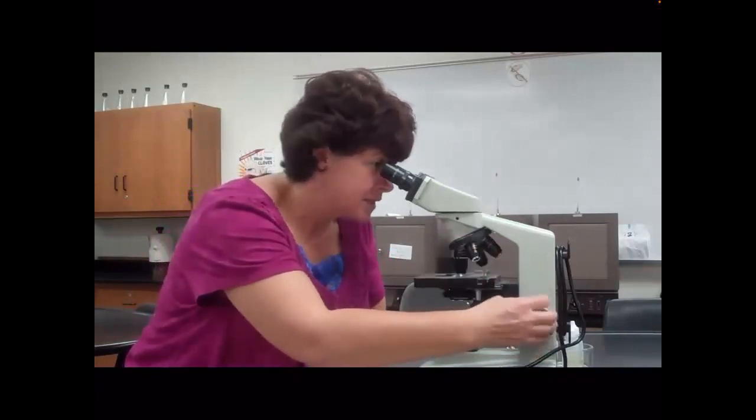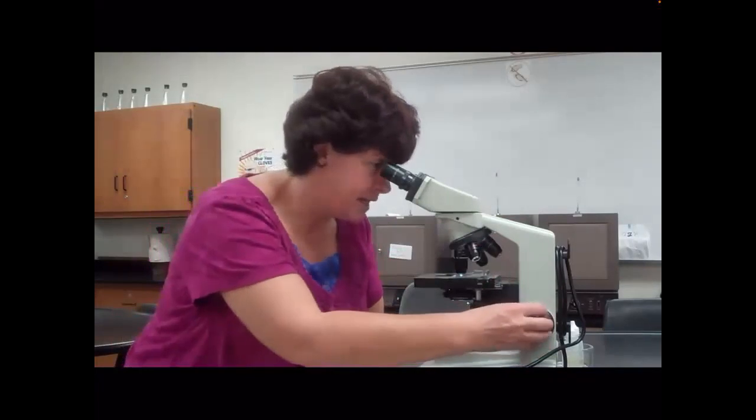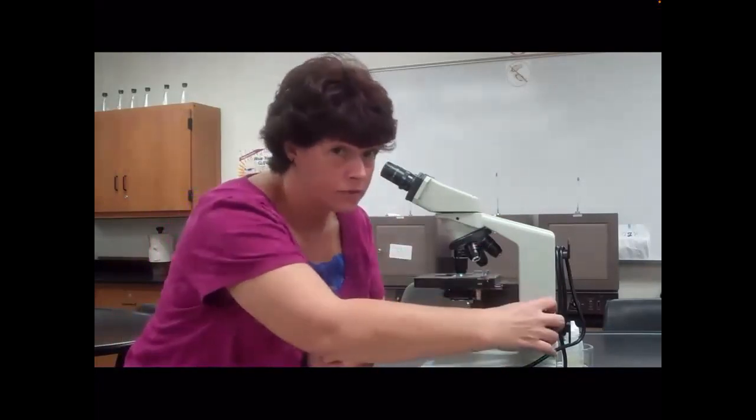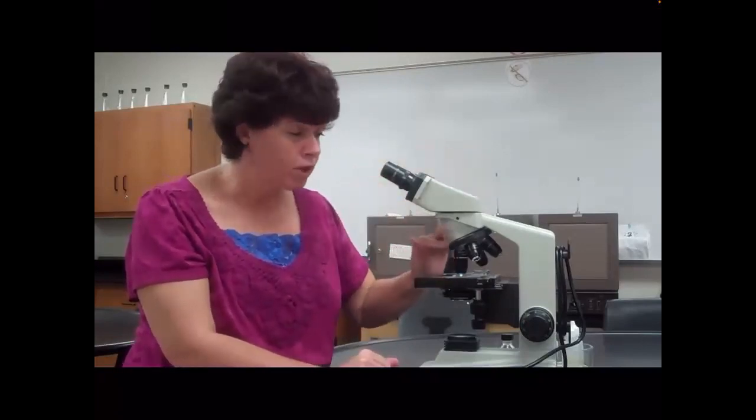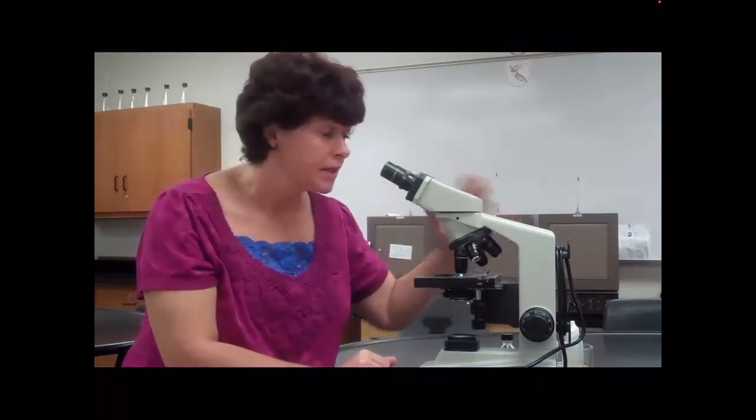Now once again, if you find that you're focusing the heck out of it, you have an issue. Your slide's upside down, your condenser's in the wrong place. It may be that your microscope is dirty. We deal with those kinds of issues. Now, if you're focusing the heck out of it, do not use the coarse adjustment to focus, okay? If you're having issues, what should you do? Last time I told you to go back a step. I told you to go from the 40 to the 10. You cannot go from the 100 to the 40 because you will get oil on the 40 lens. We cannot have oil on the 40 lens.